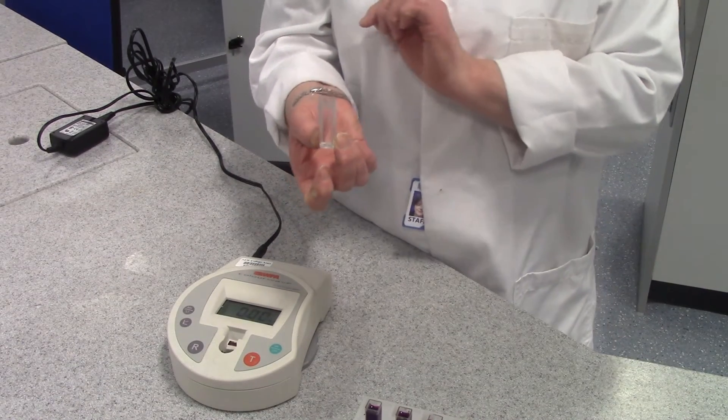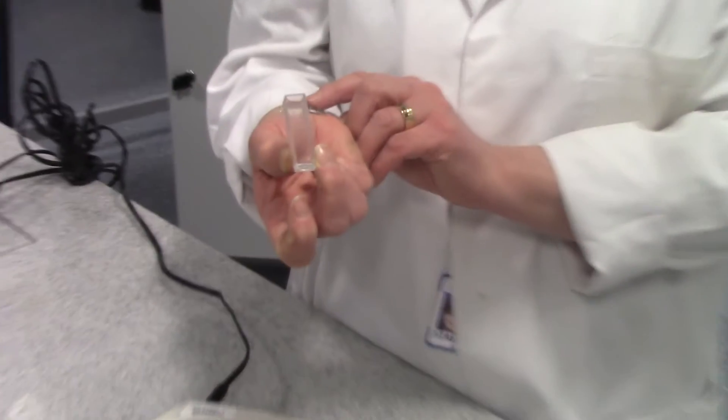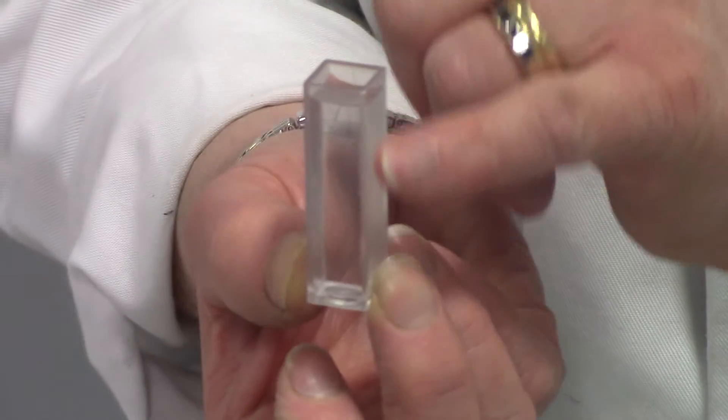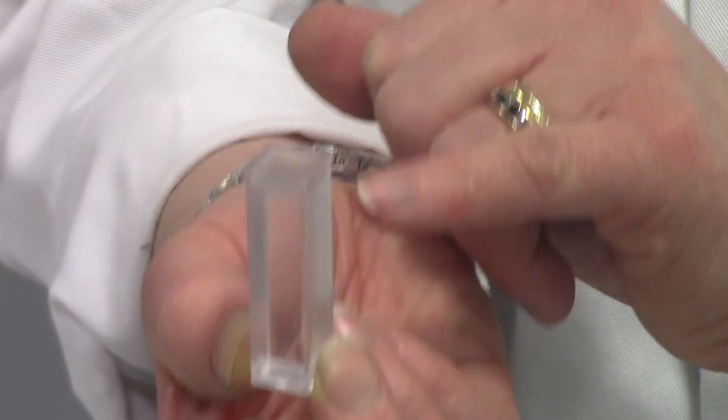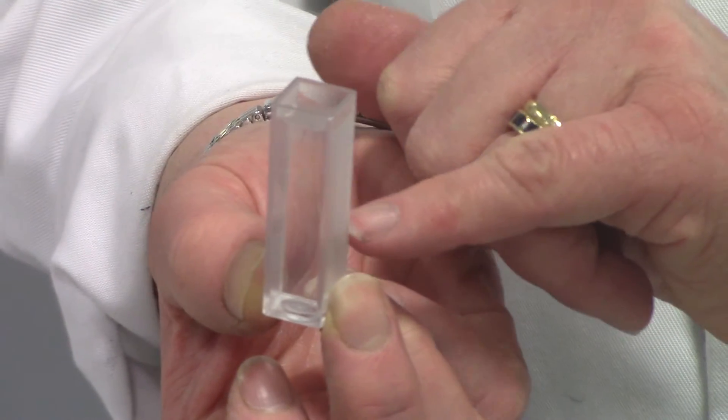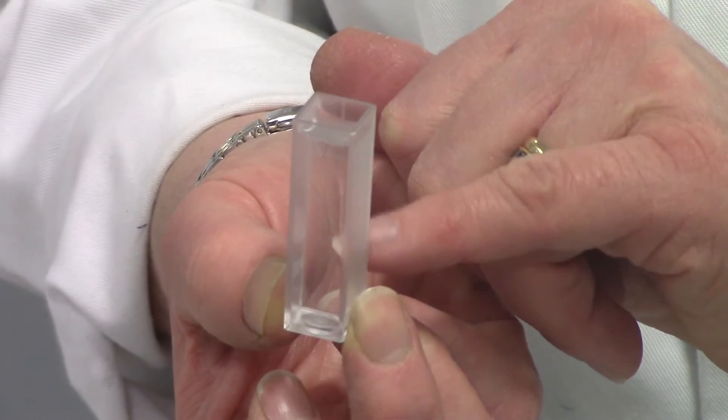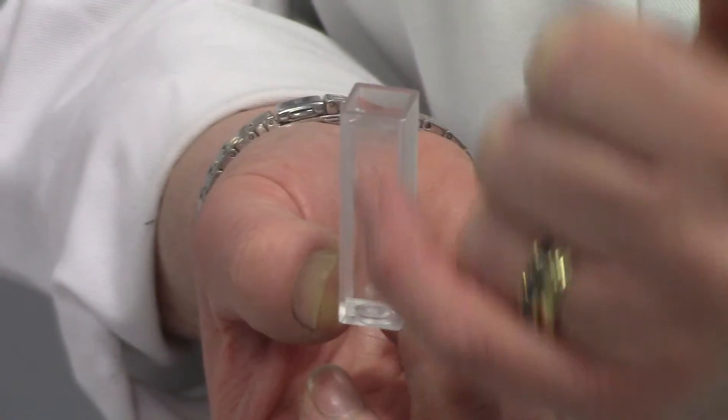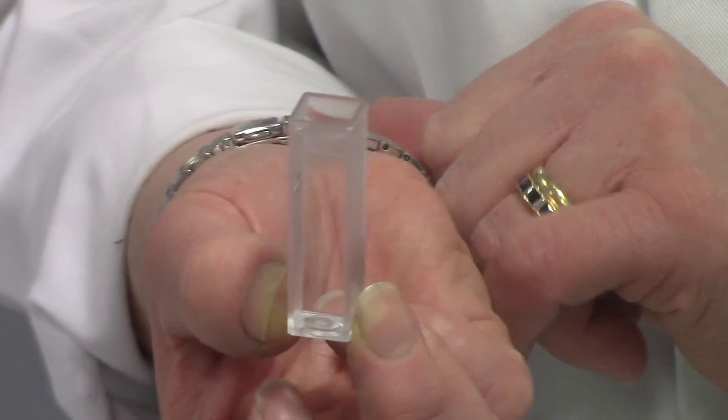The cuvette is a square tube and it's got two transparent sides and two slightly opaque sides. When you're using it, you have to be very careful that you only handle the opaque sides. You need to make sure you don't get any liquid or any dust or smudges on the clear transparent sides because this is the way that your light is going to shine through.